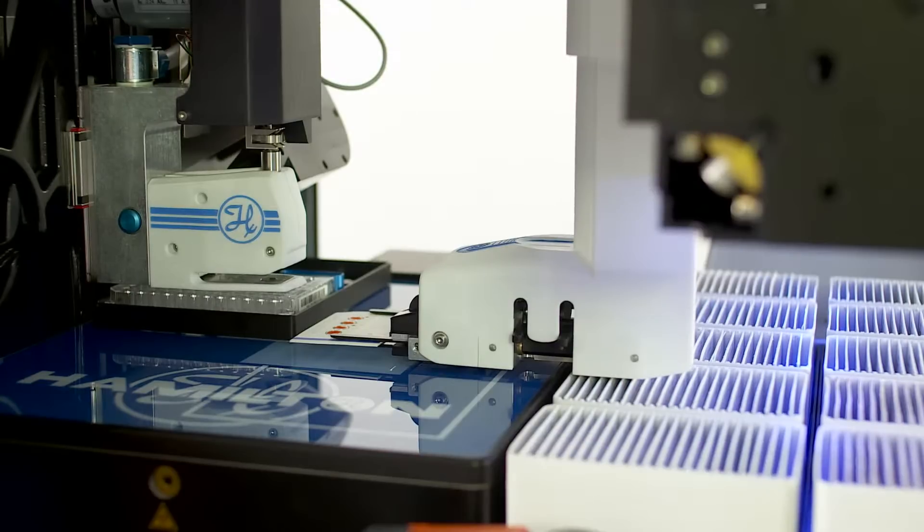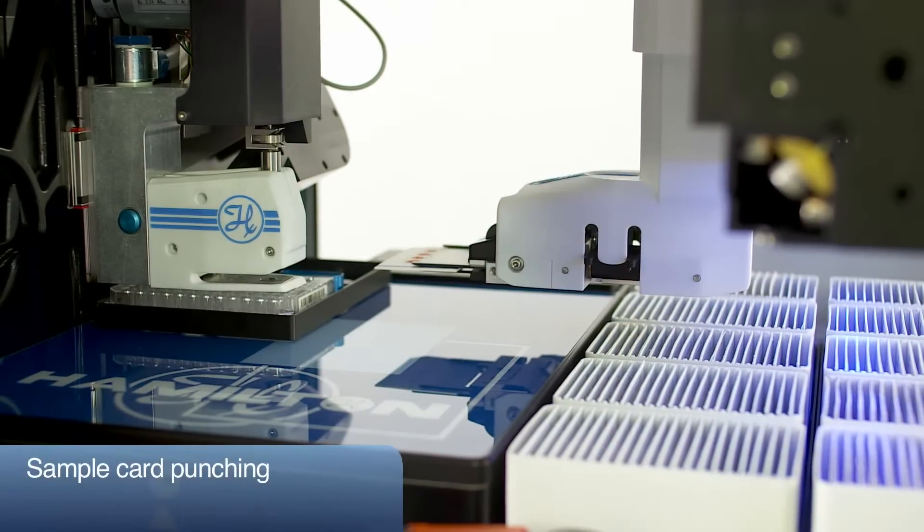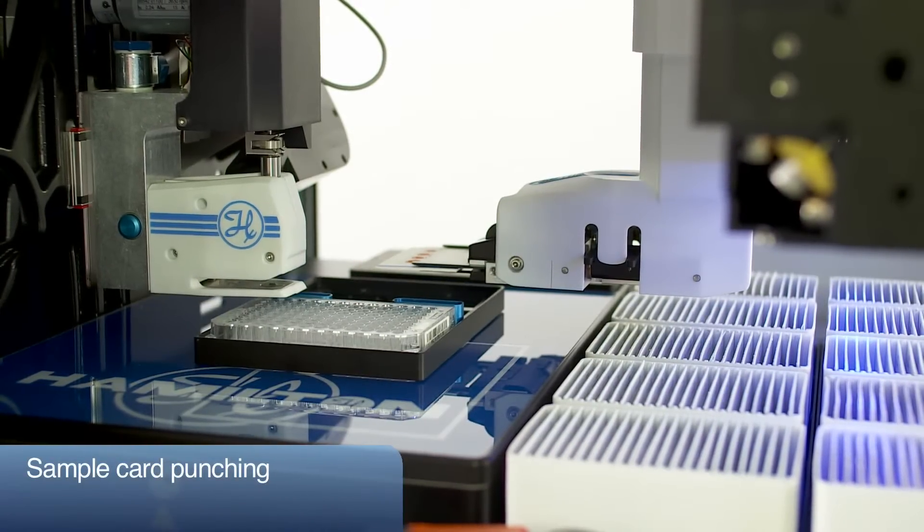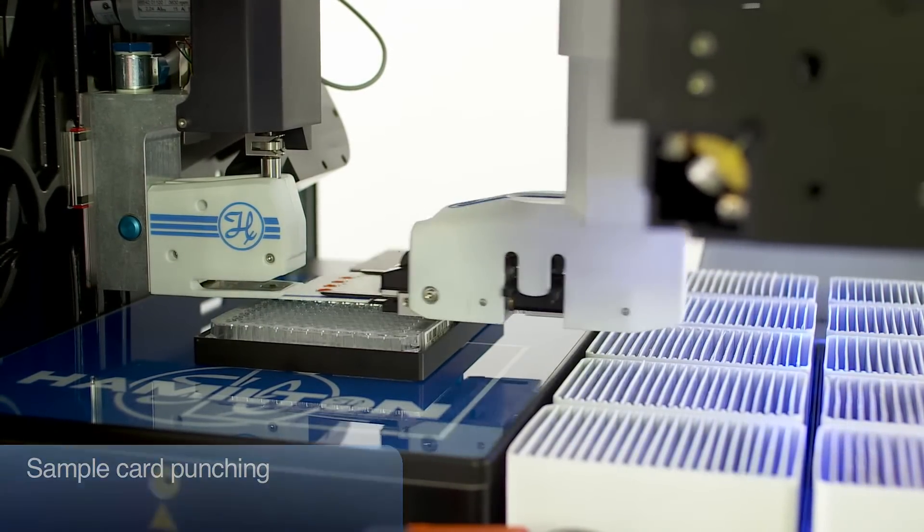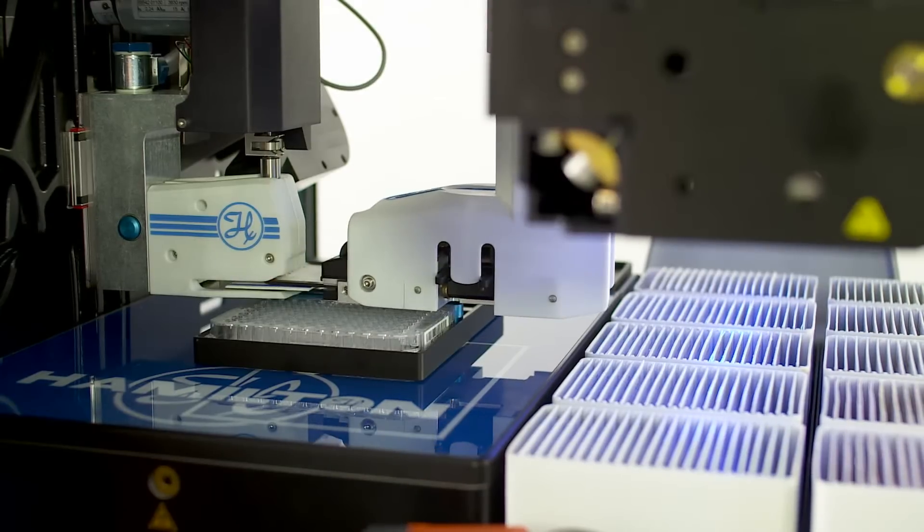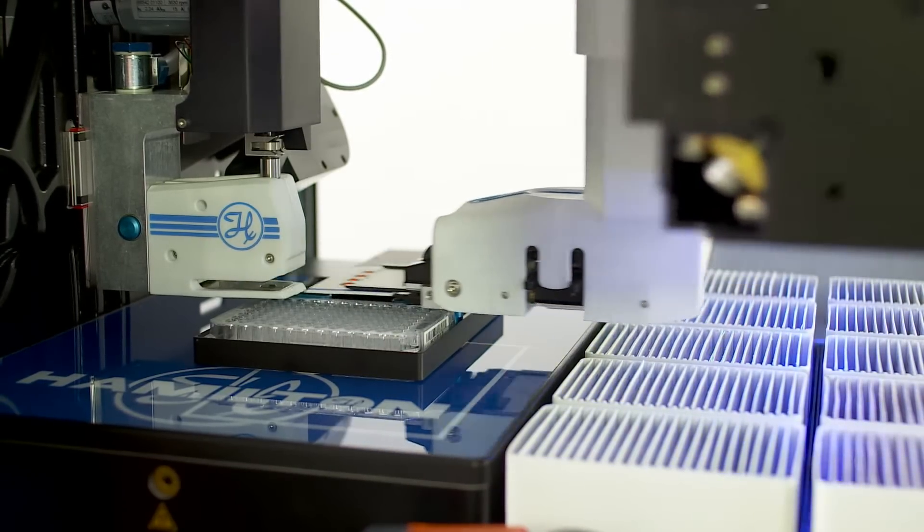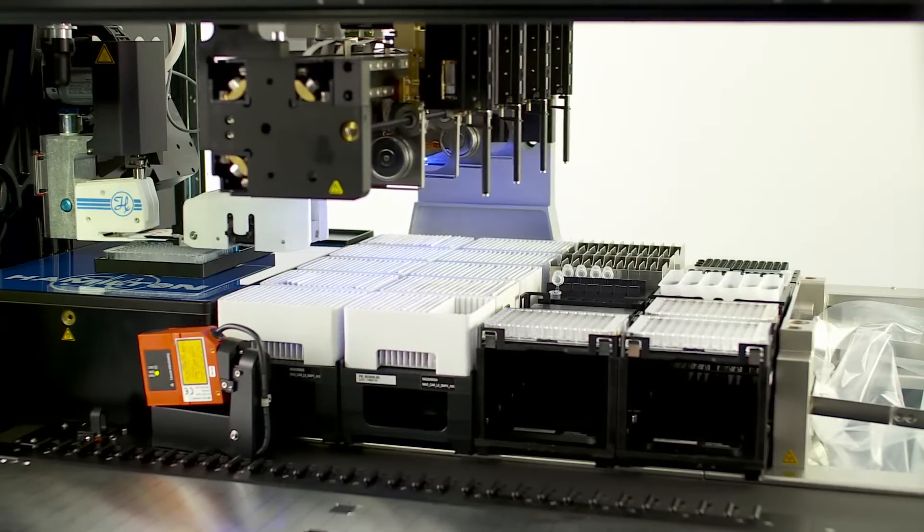The card is inserted into the punch head and the determined position is punched into the target well of the receiving plate. An ejection pin makes sure that the punched discs eject properly from the punch itself.